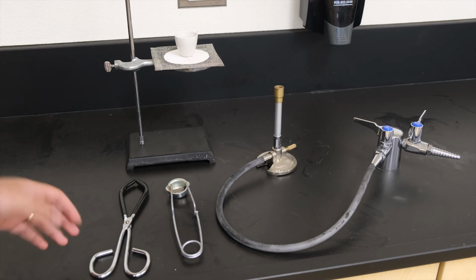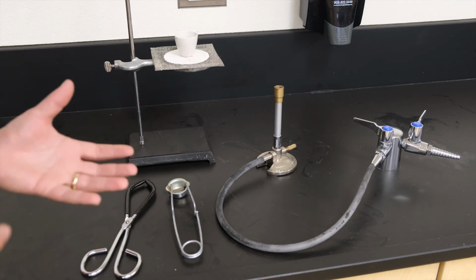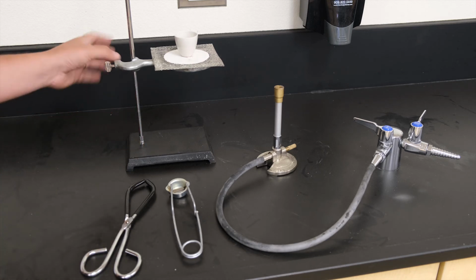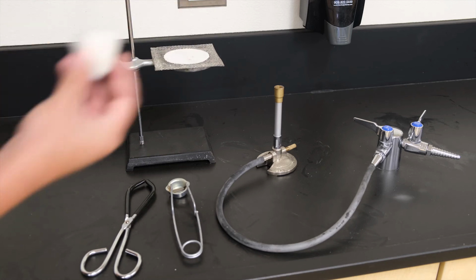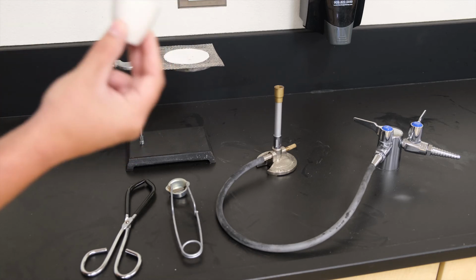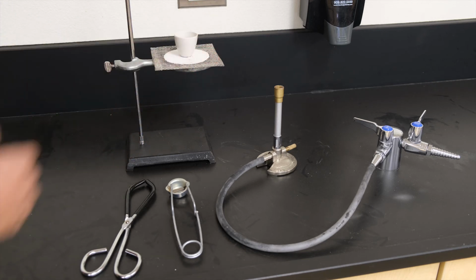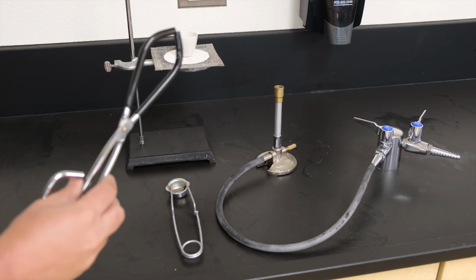I want to briefly go over the experiment setup. We've got a few pieces of equipment in front of us. We're going to start with this one back here. This is our ring stand that's going to hold the experiment. You can see there's a small cup-looking thing called a crucible. That's where the reaction is going to occur, and that way it collects the product nice and tidy for us. What we're going to use to hold our magnesium are these forceps.